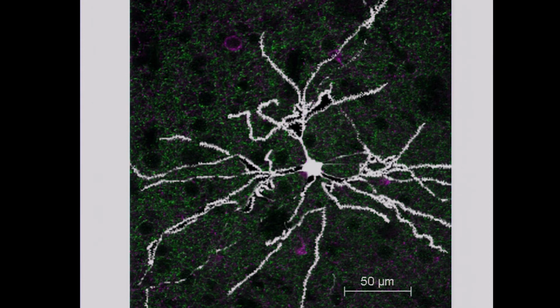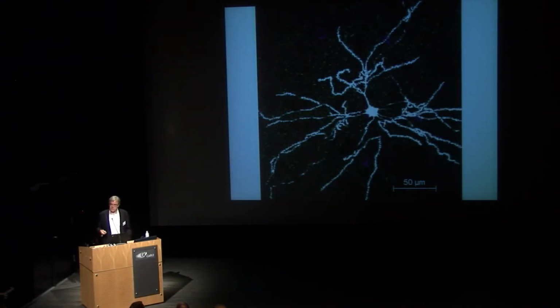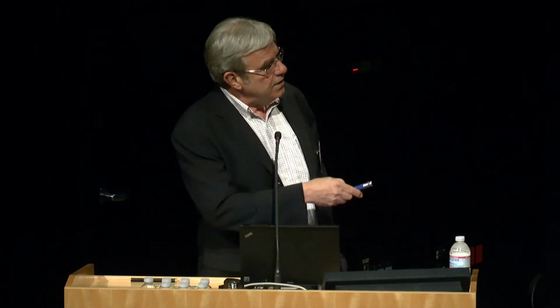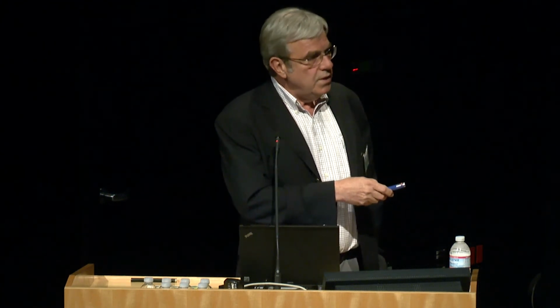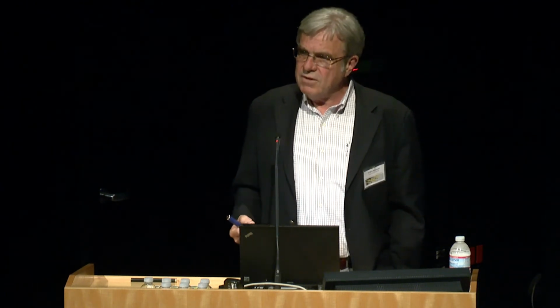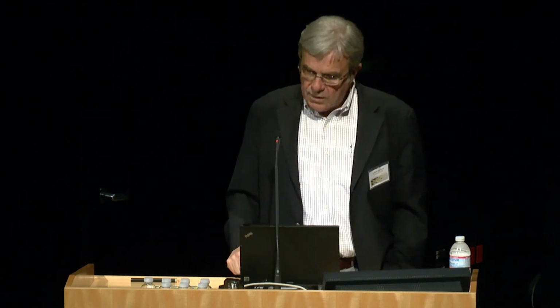So there's the cell body. We need to be next to that to be able to pick up the electrical activity. But these are all the dendrites where presumably dopamine is interacting, glutamate is interacting. But if I superimpose now on the same scale our carbon fiber electrode, remember the carbon fiber electrode is just going to detect what's released right next to its surface. The single unit activity is going to come about from neurons that are, say, within 50 microns or so of the electrode surface. So what we're getting is a very local view of what's going on.